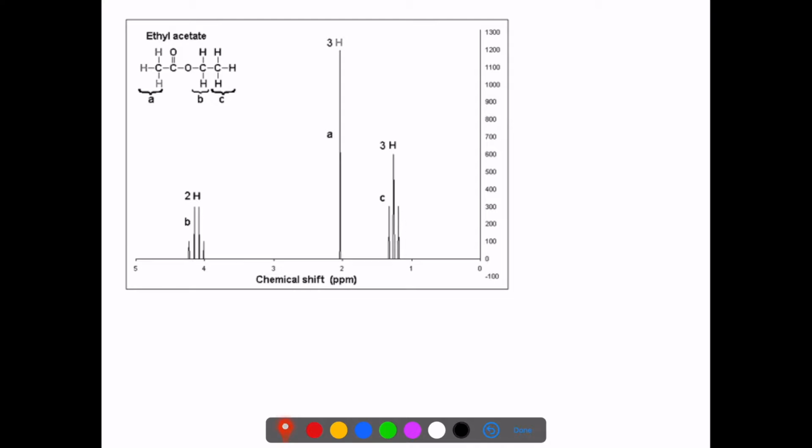So again, let's just remember how we get this NMR spectrum. You might remember that we can think about hydrogen nuclei, H1, that's what we think about here, and they all have spins that are all over the place. That is, they have a nuclear spin, and that just in nature, even though they're attached to this guy, again, they still have a nuclear spin, and their spins are just all over the place in terms of they're not aligned. We stick them in a magnetic field.